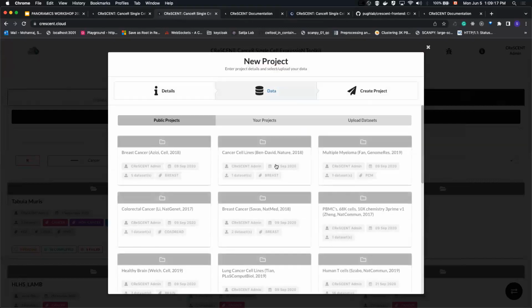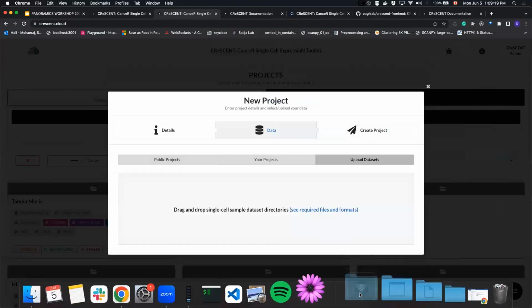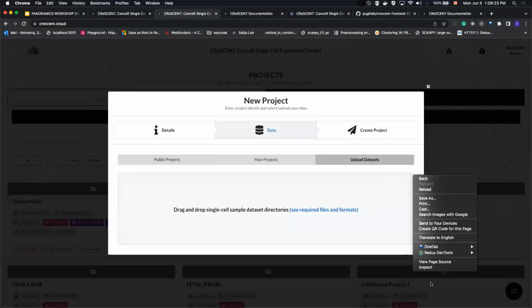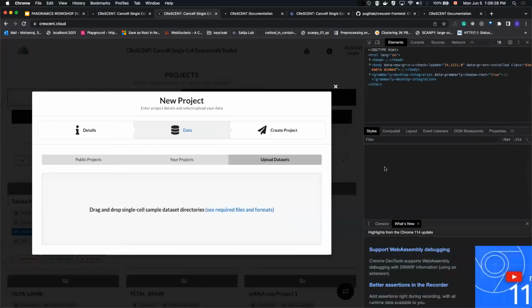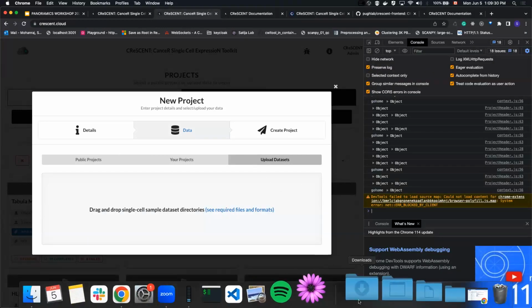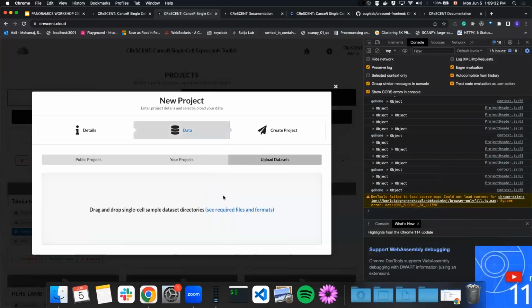We should. Let's see if this is bugging out right now. All right, so there could be something wrong with the upload here, but I should figure that out by the end of this talk.